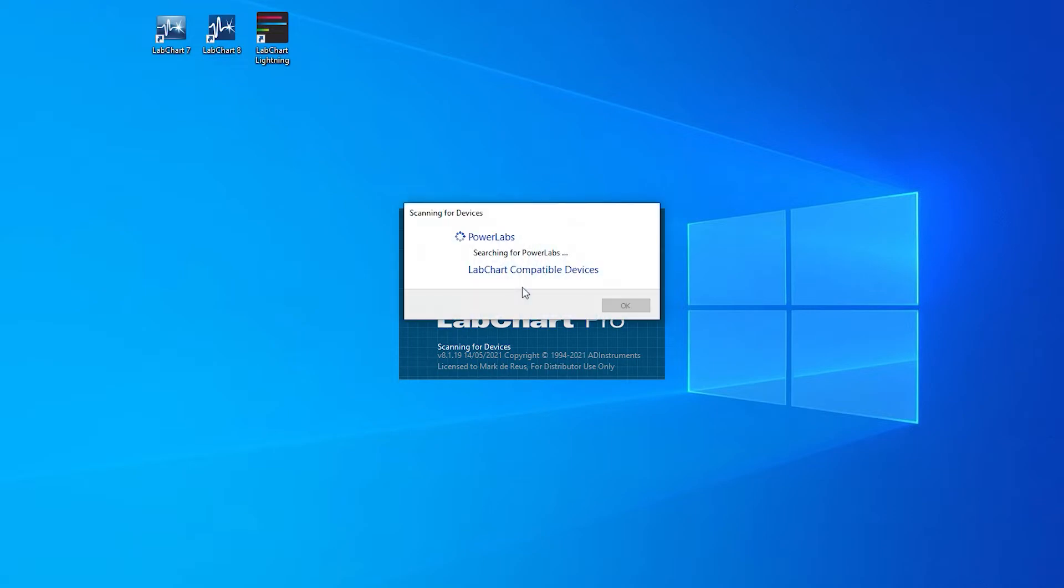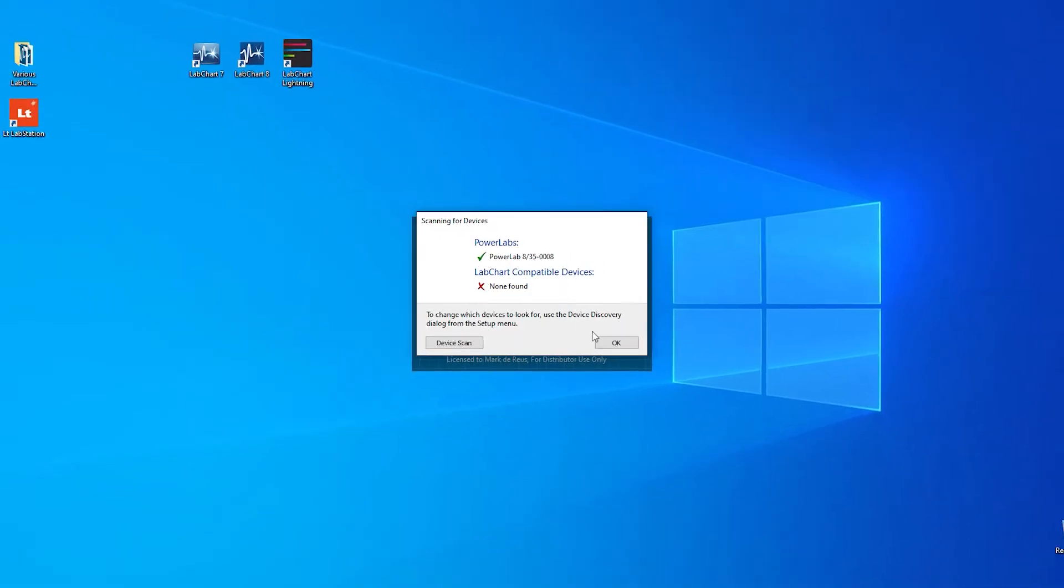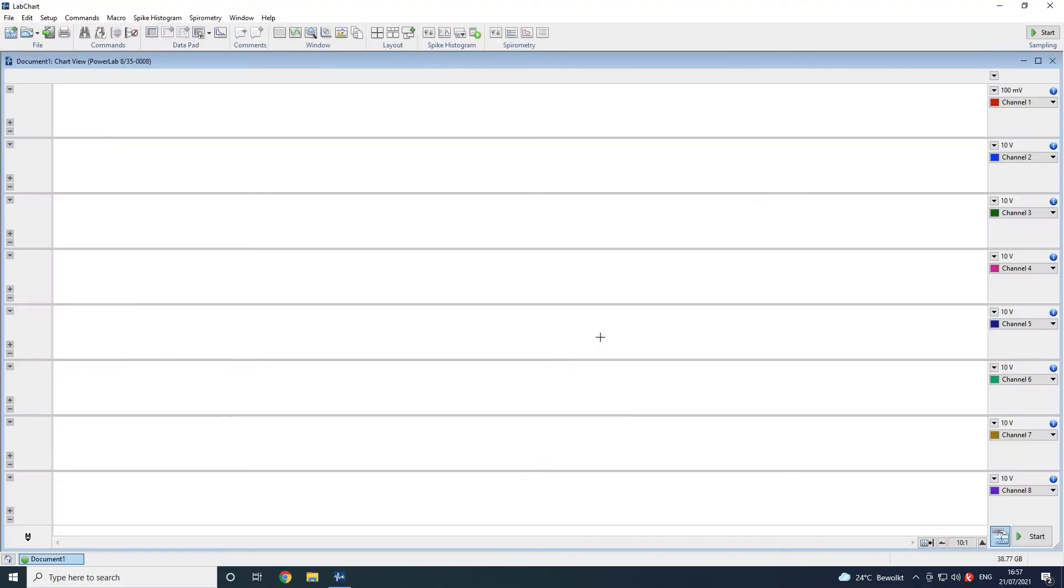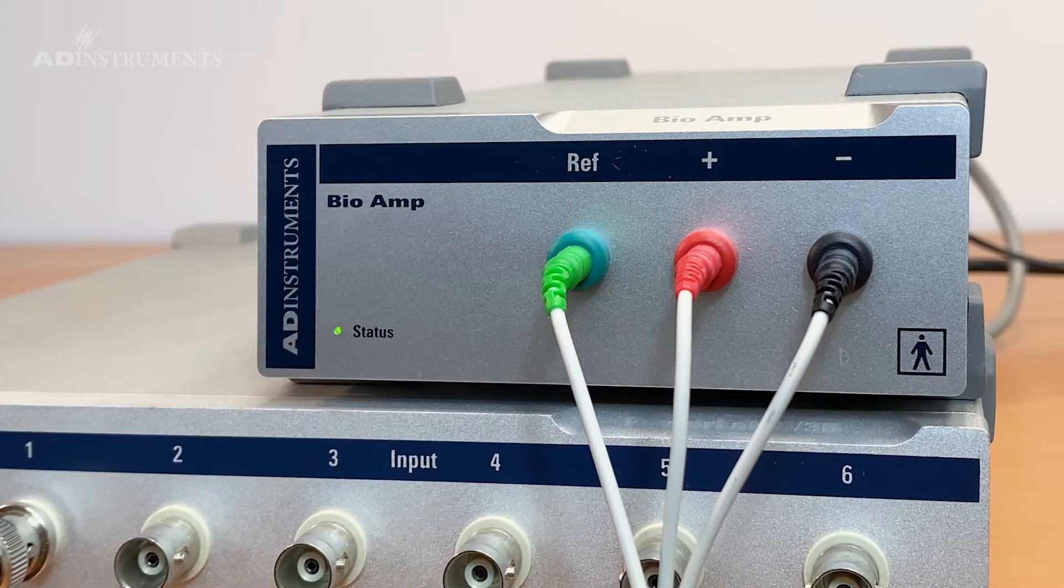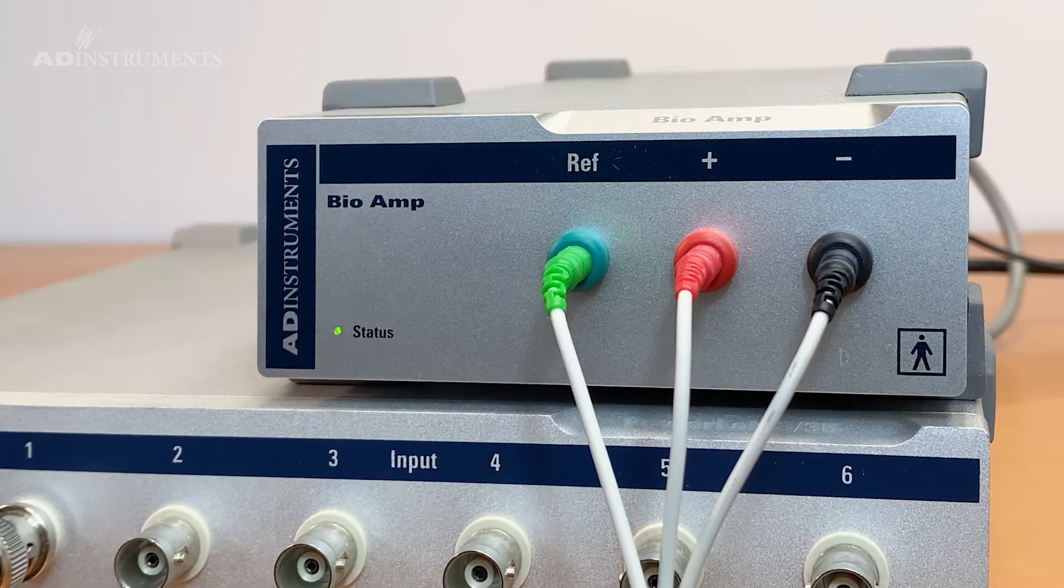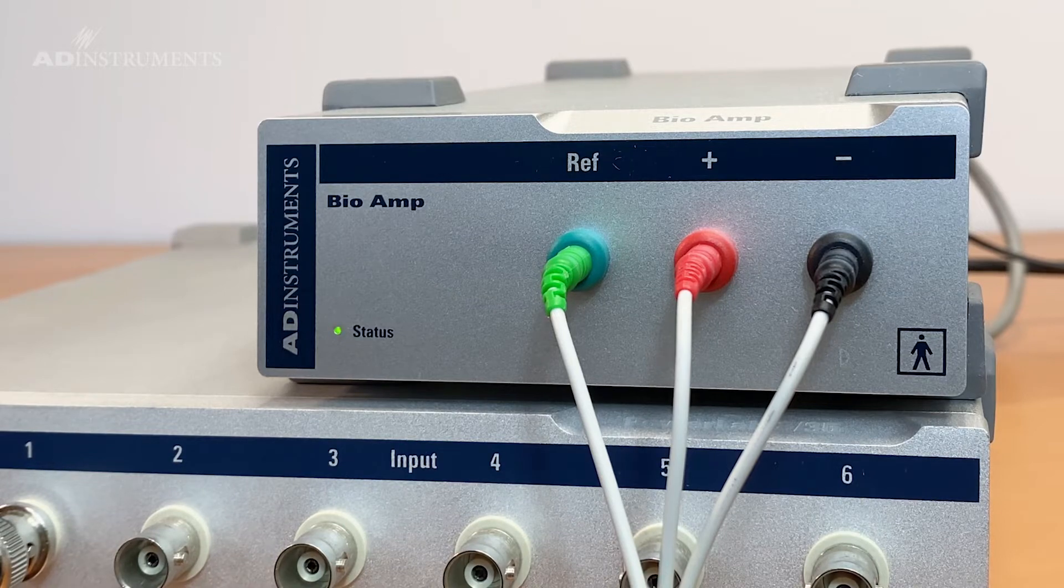Now start lab chart. When the bioamp is correctly detected by lab chart, the status light will turn a solid green.